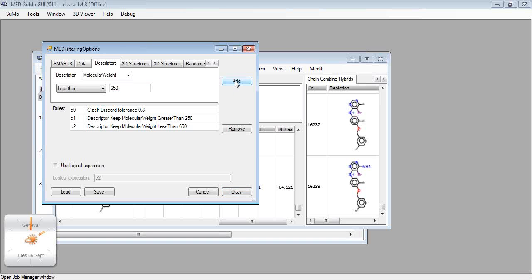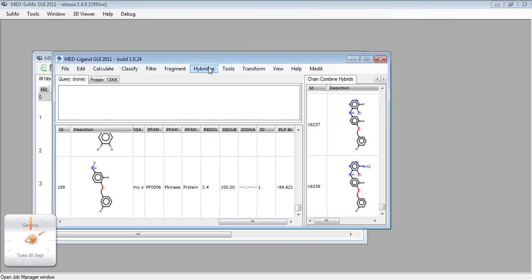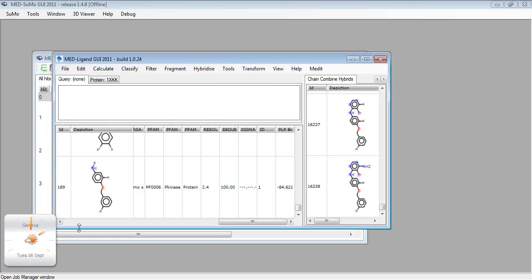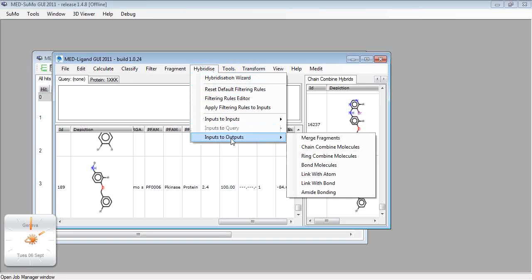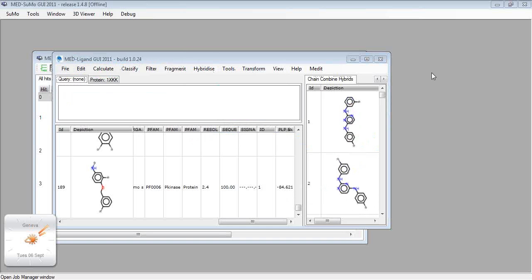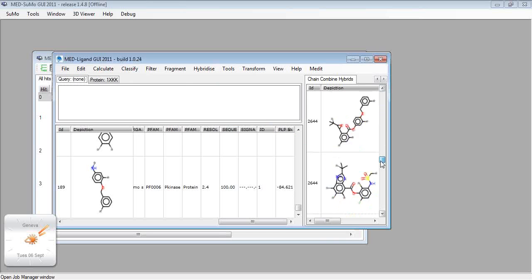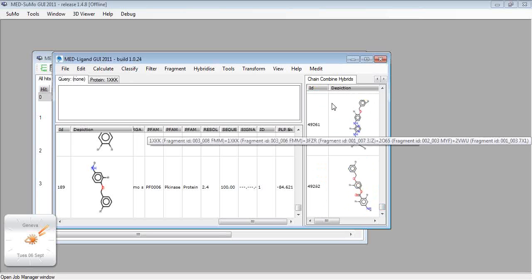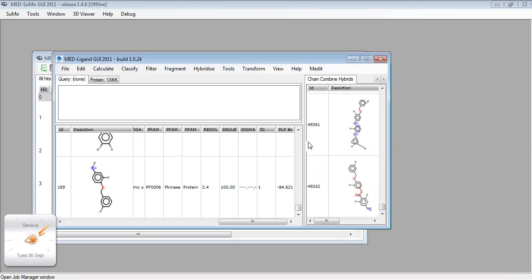So I add this, I click on OK, and I launch this 4th step of hybridization. You will see that it will take some time. You can see that on the clock that I have on the left bottom part of the window. So let's launch that 4th step, and switch off the recording. Okay, that's almost finished now. We have 49,000 hybrids for this step.